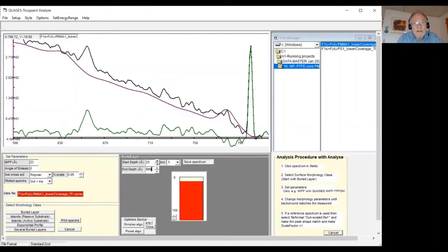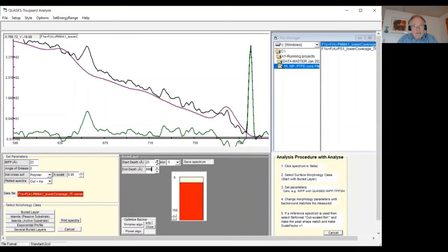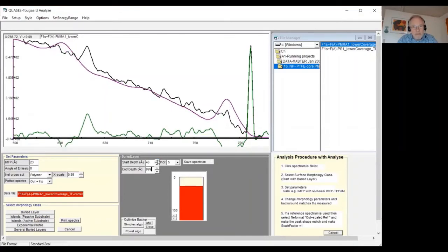And we find the thickness of the coating, and you see with about 40 or 50, we have a good account for the background here in a wide range. It's not so good here. So this probably means that this is not the right structure, but this 45 angstroms, 4.5 nanometers, would probably give us a rough indication of the average thickness of the coating.